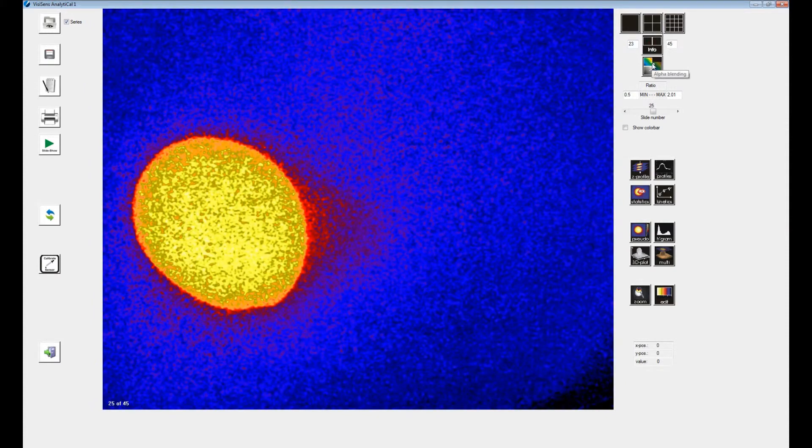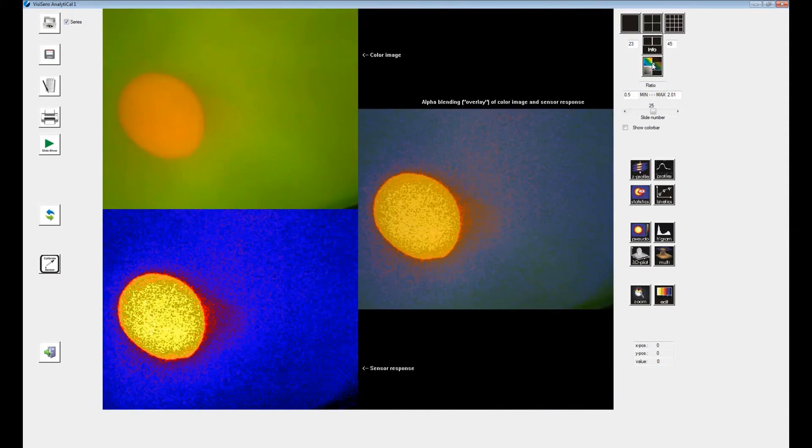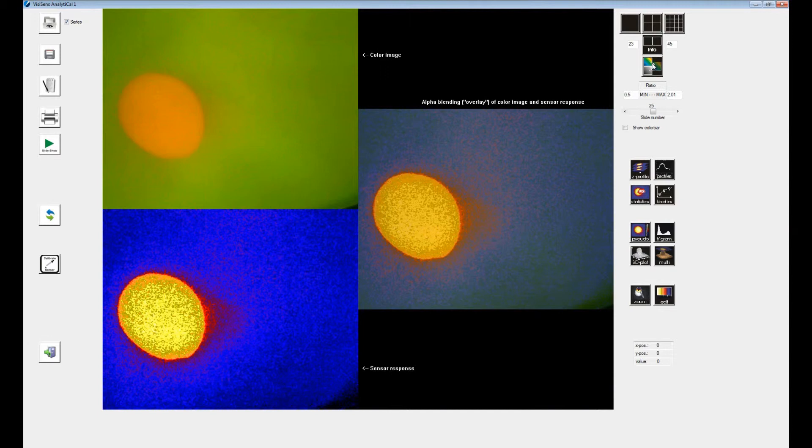Alpha blending is another display function. Here the original image is displayed on the upper left, the processed image on the lower left. A blended image of the two is displayed on the right.